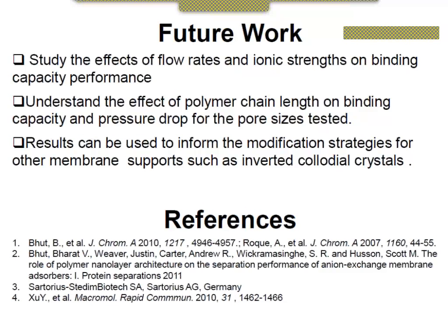Then in the future, we think it'd be beneficial to study the effects of flow rate and ionic strength on binding capacity performance. Also, it'd be interesting to understand the effects of polymer chain length on binding capacity and pressure drop for the pore sizes tested. And also, we would like to use the results we got here on inverted colloidal crystals, which are more spherical and uniform membranes.